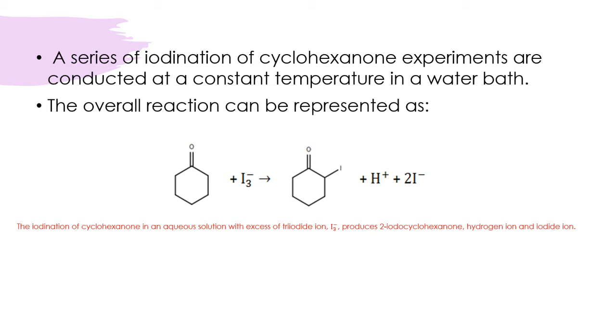On top of that, you need a quantitative measurement of the color change.